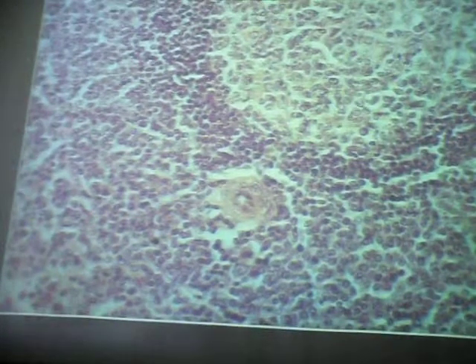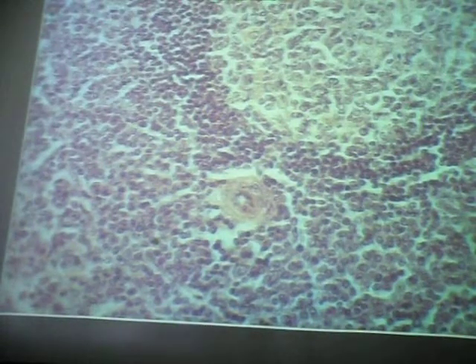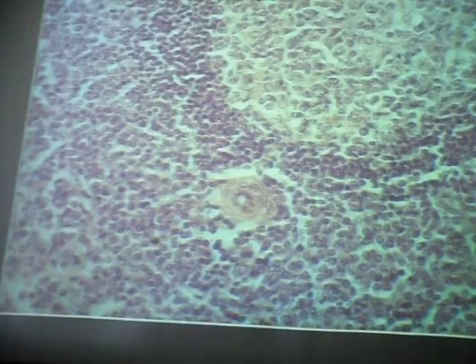And it's fairly distinctive. Like I say, I'll give you good examples. There shouldn't be any guessing if you've seen these things. Some of those slides are better than others. And I'll take out the good slides. Like this. Okay? So if you've seen them, you shouldn't have any trouble.